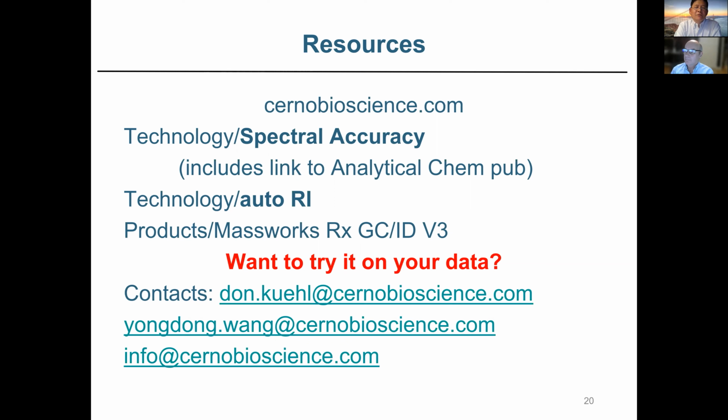The question is whether the same or similar approach can be applied to 2D chromatography. Well, you get another level of separation. I have no idea, and I haven't even thought it through, how you would do retention. I guess you could figure out a way to do it. I'd have to really think about that. I've never thought about it that much. We haven't run across all that many customers that are doing 2D chromatography. But I would say that I don't see why not. It's a great question.